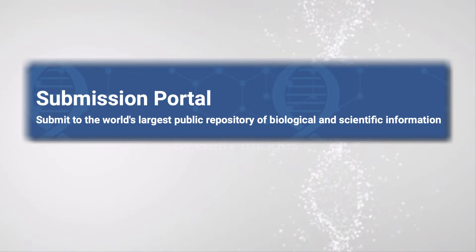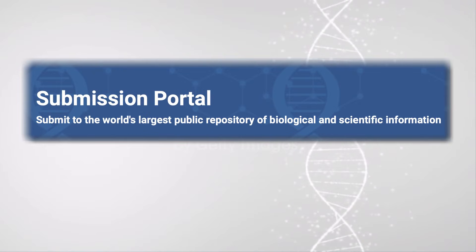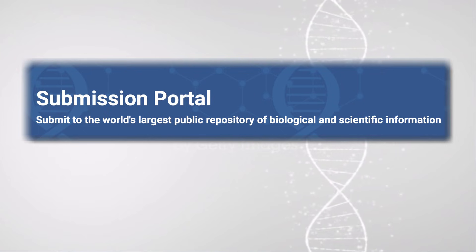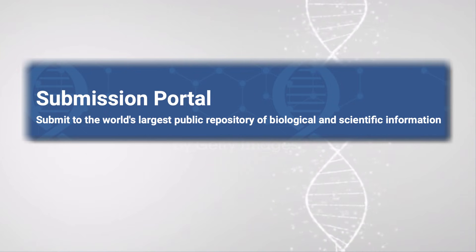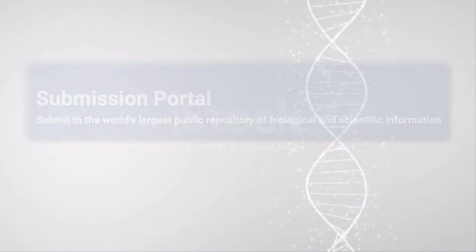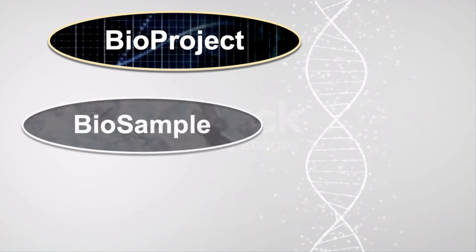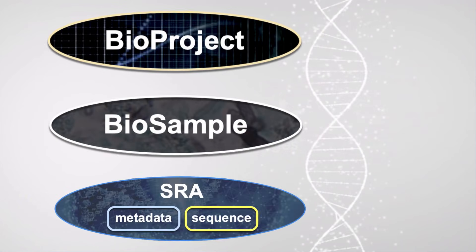This video is a step-by-step tutorial, mostly for people who have never submitted to SRA before. An SRA submission includes a few core components: bioproject, biosample, and SRA, with both metadata and raw sequence data.